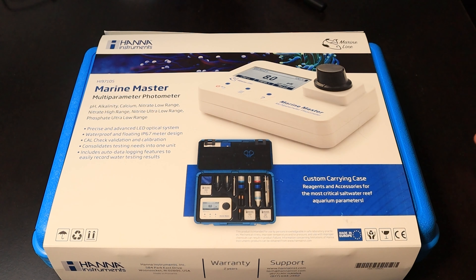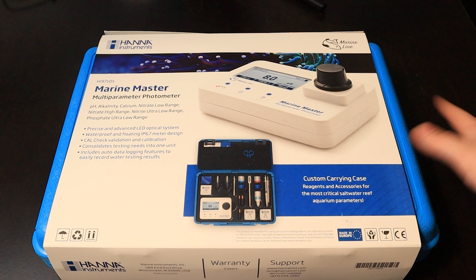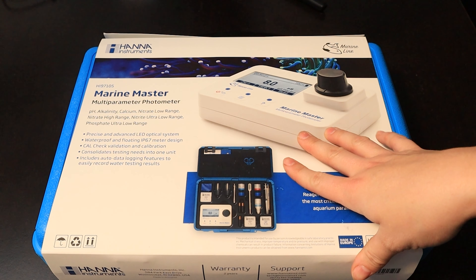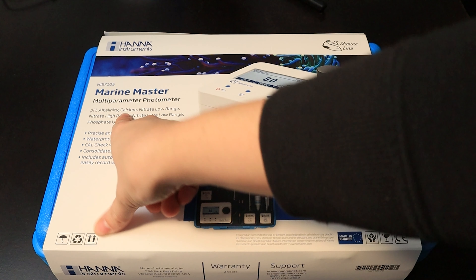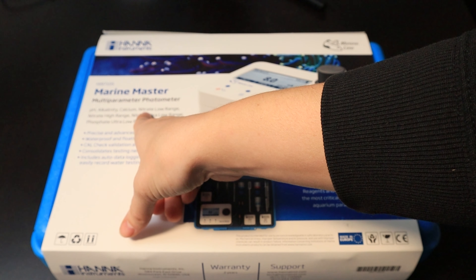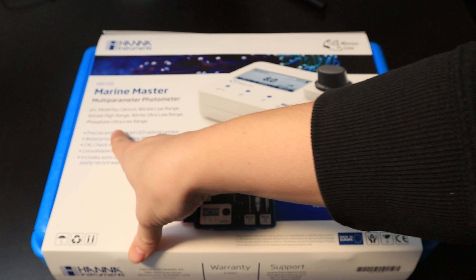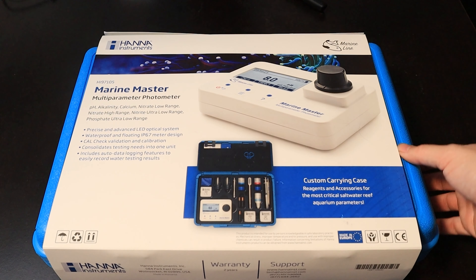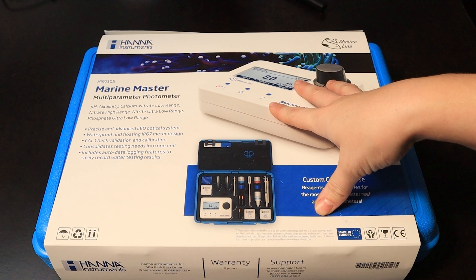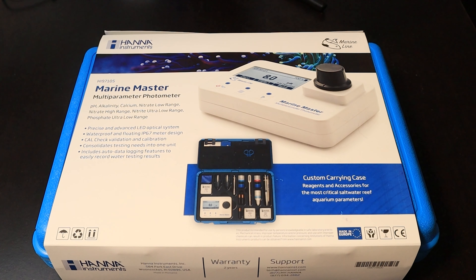Hey guys, welcome back to the channel — it's been a little while. Today we're going to go over the new Hanna instrument Marine Master multi-parameter photometer. It does your pH, alkalinity, calcium, nitrate, nitrites, and phosphates ultra low range. I'm pretty excited about this. It comes in a nice handy box that keeps everything you're going to need, instead of having a bunch of Hanna checker boxes sitting around. I'm actually going to sell the rest of mine and just use this one to double check all my tanks.